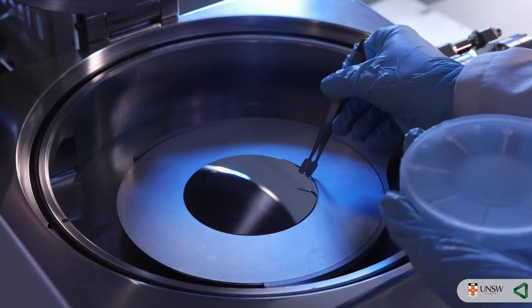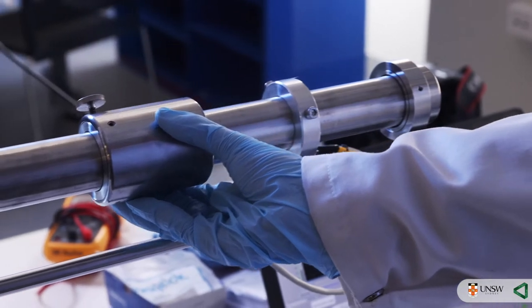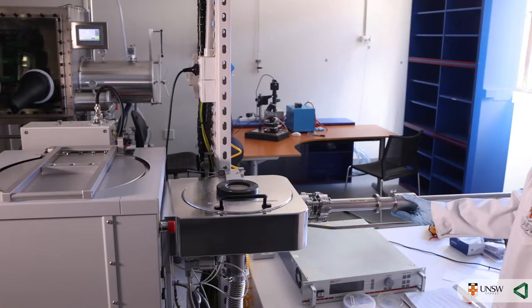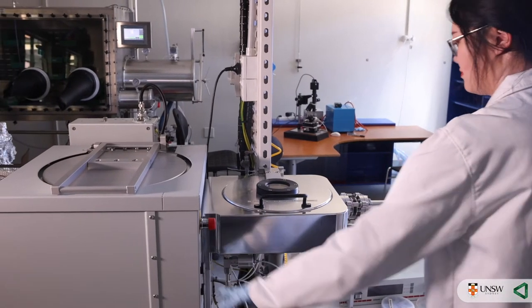Then we have two different precursors that will pulse into the chamber in vapor phase and the oxide will grow atomically layer by layer.